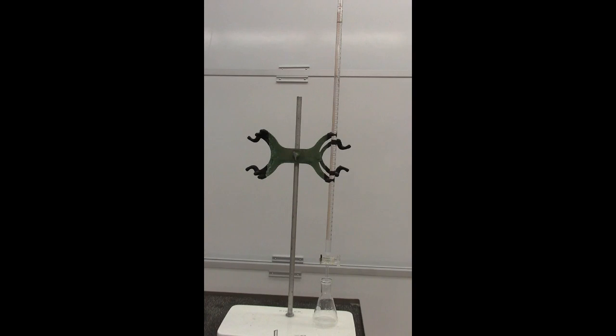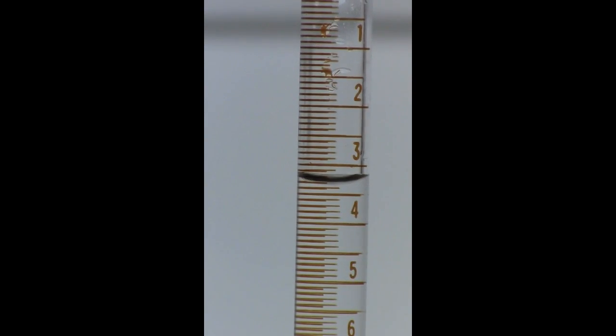Now we're ready to start the titration. The first thing we're going to want to do is to record the initial volume of the buret up here at the top. In order to correctly measure the starting volume inside the buret, we want to measure the volume at eye level at the meniscus. The meniscus is the bottom of the bulgish part of the liquid that's inside. So at the bottom of the disc that you see here, we want to measure at that line.